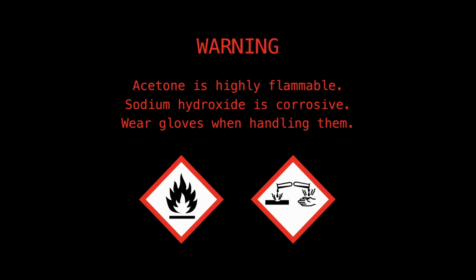Warning: acetone is highly flammable. Sodium hydroxide is corrosive. Wear gloves when handling them.